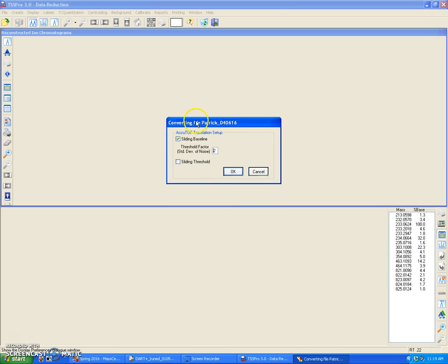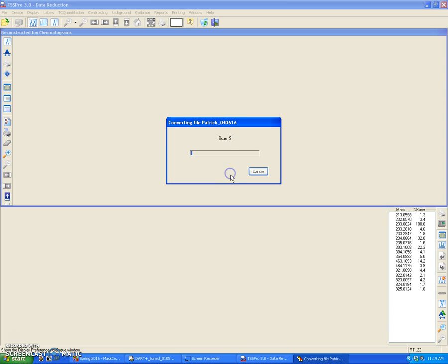This other window will pop up, or it will ask you to put a threshold factor. You can just leave everything at default and click OK. Translation from the AccuTOF file to the TSS profile will proceed. So this will take a little while, so I'm just going to pause the video here and come back when it's done.